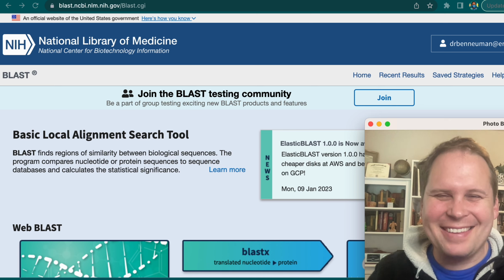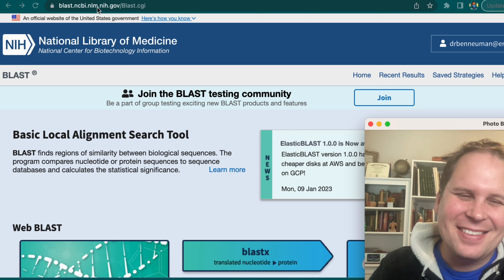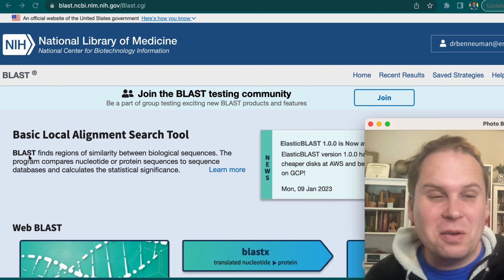Are you ready to blast? Of course you are. Blast, there you go. That's the website. Basic Local Alignment Search Tool.